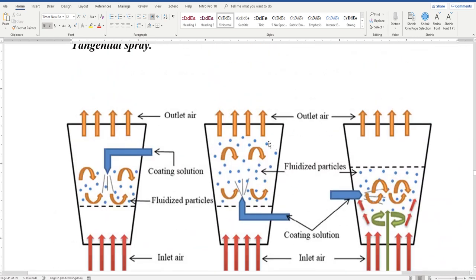One of the common problems with this method, because it suspends and agitates the tablets, what is it? The tablets hit each other and they may break. Okay, this is one of the common problems because the method used here is really tough for the tablets to withstand.